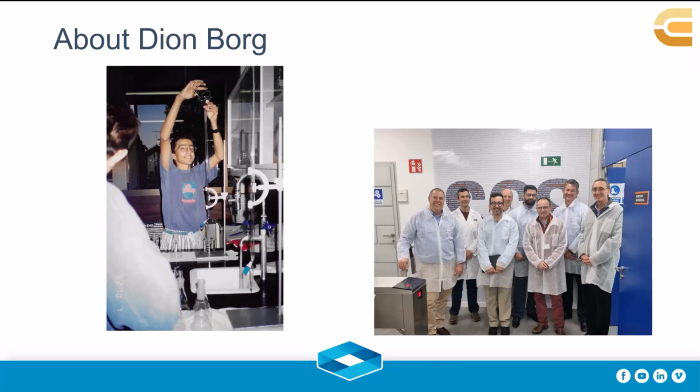But I went on, obviously, to study chemistry at university and work in a nickel refinery up in Townsville in North Queensland, and worked in that laboratory for about 9 years. 6 years of that time, I was the LIMS administrator for CCLAS, so I'm used to using CCLAS in a real-world laboratory environment.